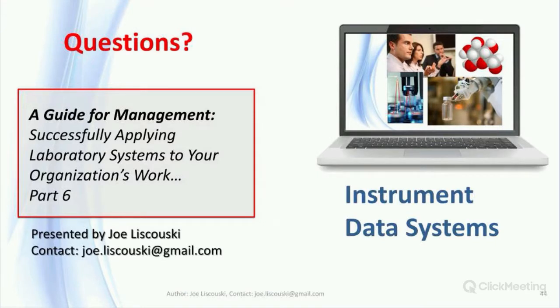But we need to start looking more at 2 areas in particular. One is integrating the same type of technique into one computer system, and the other is something that we need data standards to do, and that is the ability to have third parties look at different ways of analyzing data. Right now, if you bought an NMR, you'd buy the instrument and the computer system, and you'd run the vendor's software because it was all tied together.